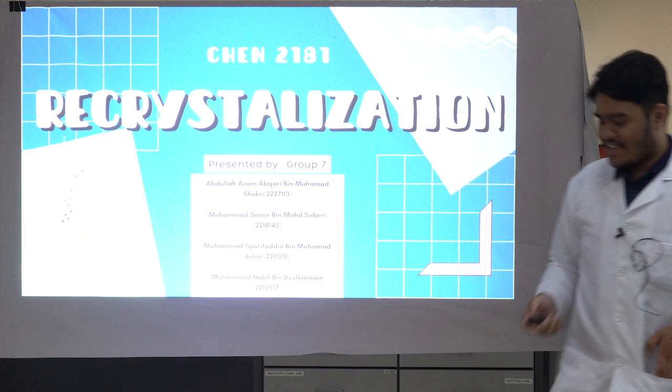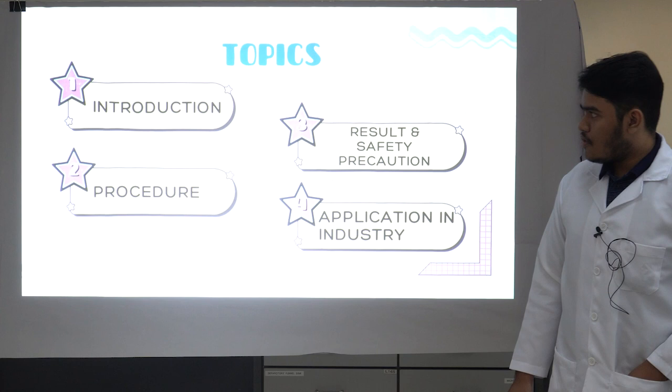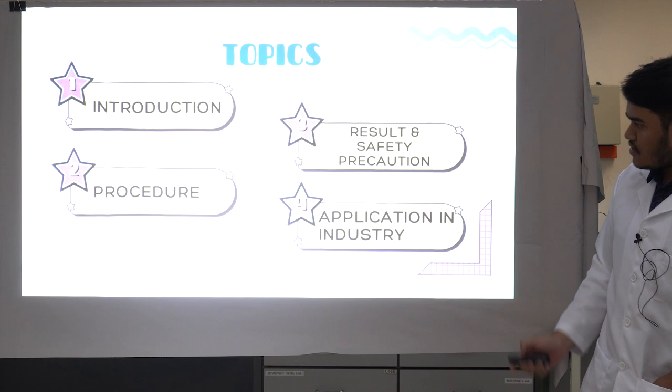Okay. And today's presentation we will be presenting about recrystallization. In our presentation today, we will be talking about four parts: the first one is the introduction, the second one is the procedure, the third one is the result and the safety precaution, and the fourth one is the application in industry. So we will talk about the introduction and the problem statement.